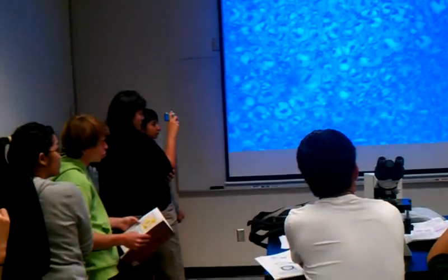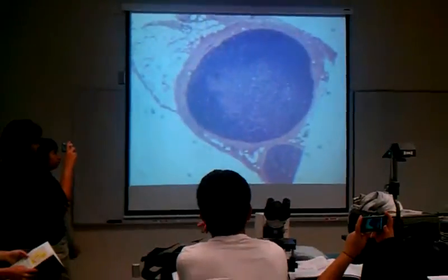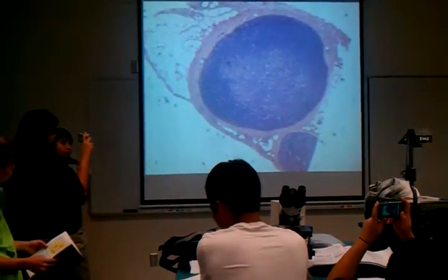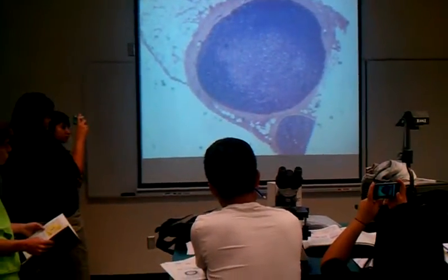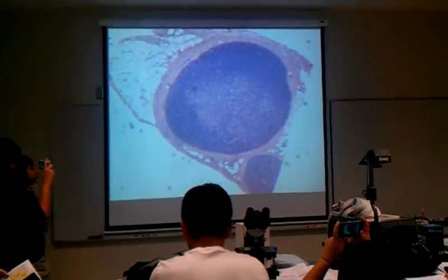So all these dots and this white area are myelinated axons, and there are hundreds and hundreds of them. So each fascicle, zoom out again, is composed of hundreds and thousands of axons surrounded by the perineurium. So the perineurium is included within the fascicle as well. Some other things also.